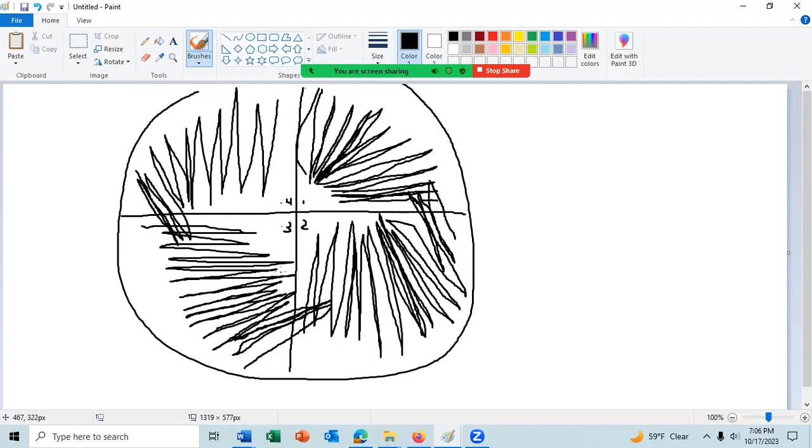Someplace along the line where you're streaking, it might be here, it's oftentimes in quadrant 4. If it's really dilute, it could even be in quadrant 1. You will be plating down individual cells. So I'm going to draw it here, where we plate down an individual cell right here on the streak, and that will grow into a colony given time. And so you'll see individual cells in this region of sector 3. And that's because we're plating individual cells down.